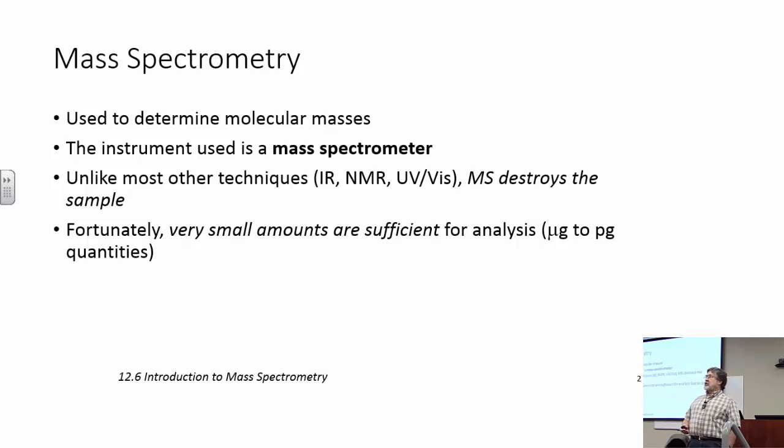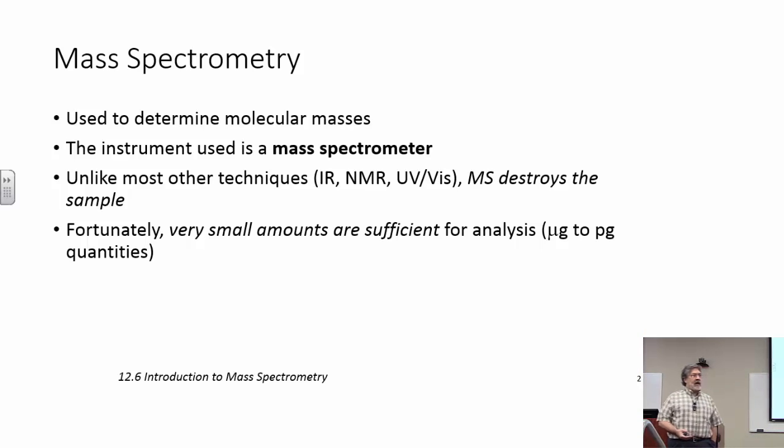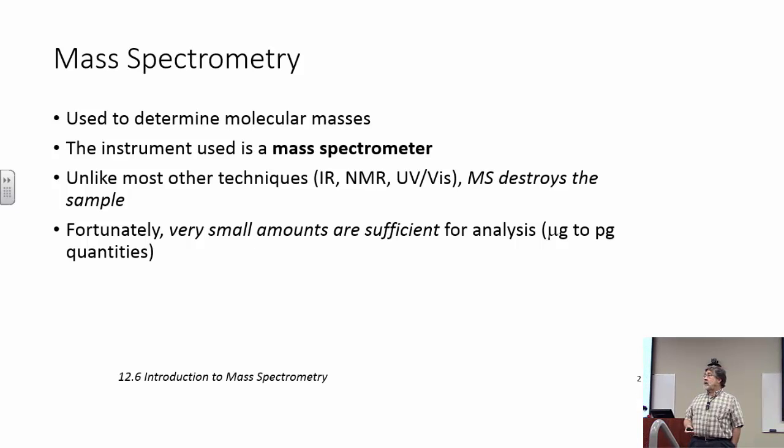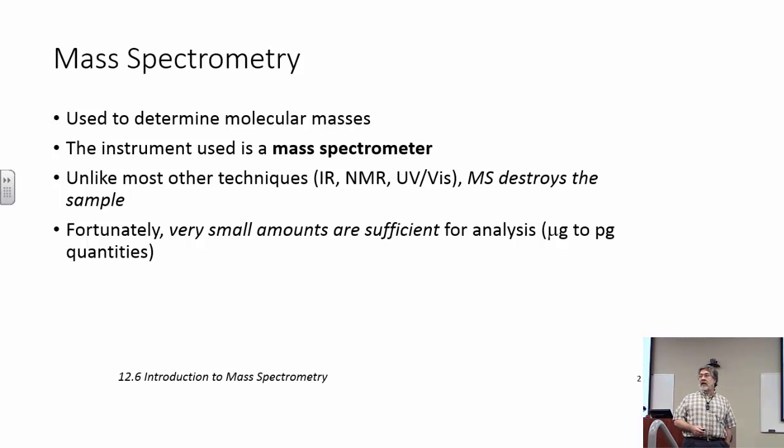With low resolution, you're only measuring 2 decimal places at best. And given only 2 decimal places, there will often be a couple, perhaps even a few, maybe even several, depending on the particular situation, of molecular formulas that will have the same molecular weight to only 2 decimal places, but only one molecular formula will have a precise mass that equals what the instrument gives you. So that's the main difference between high-res and low-res mass spectrometry.